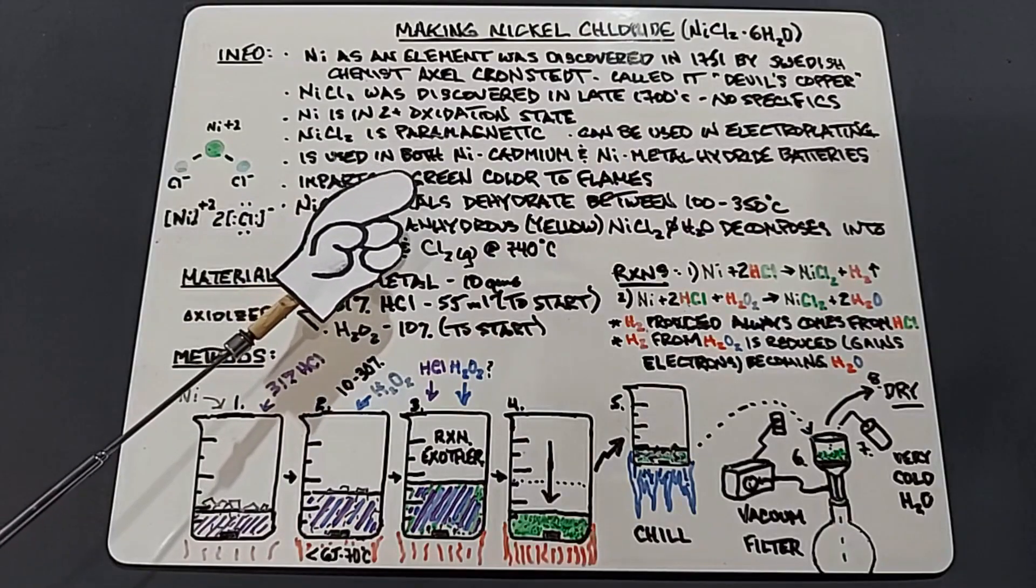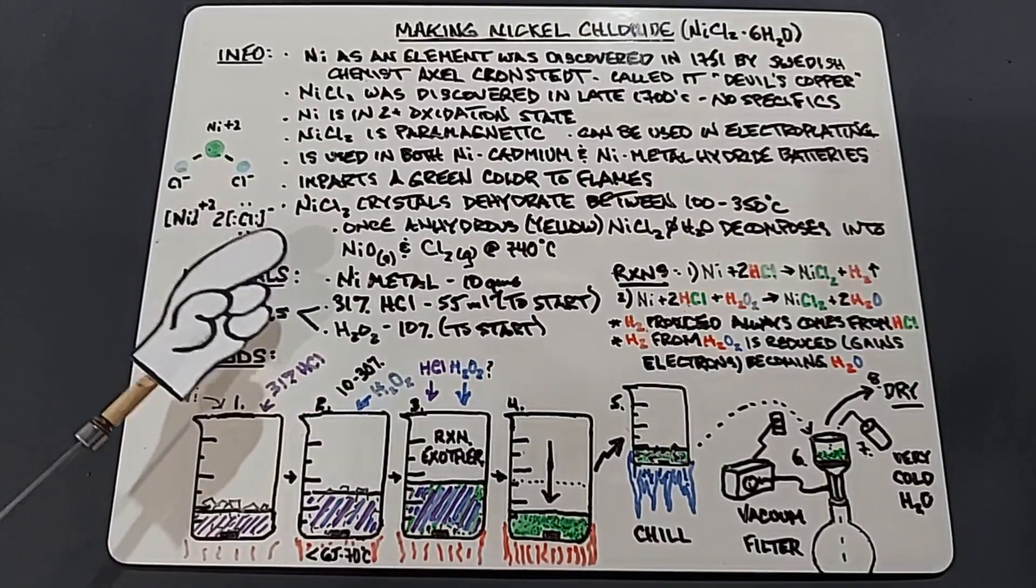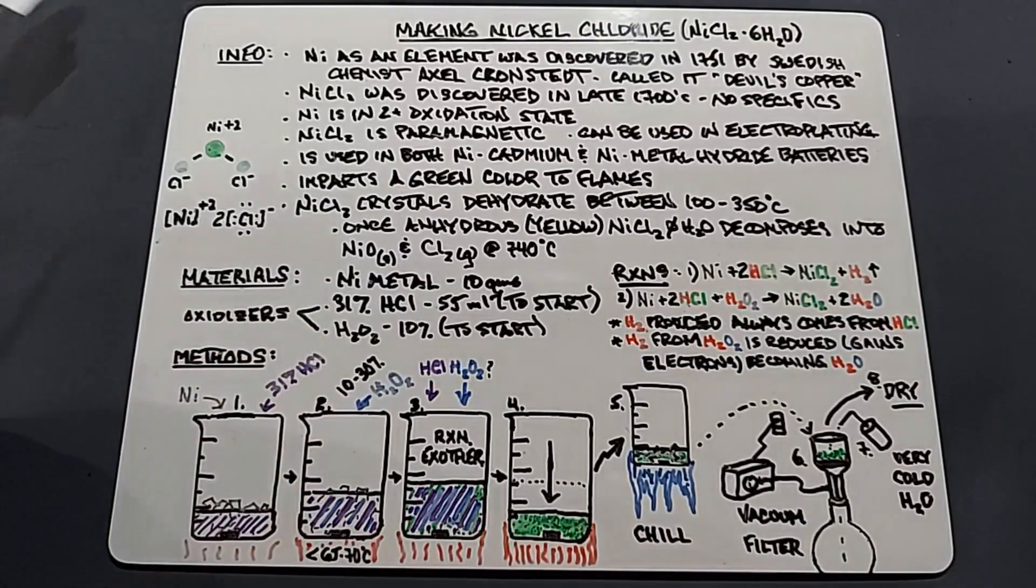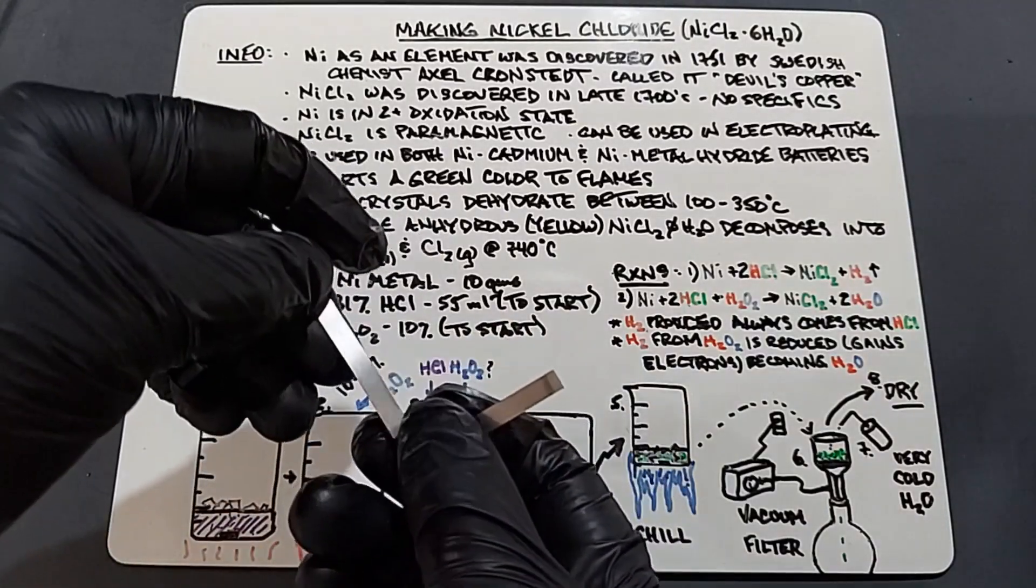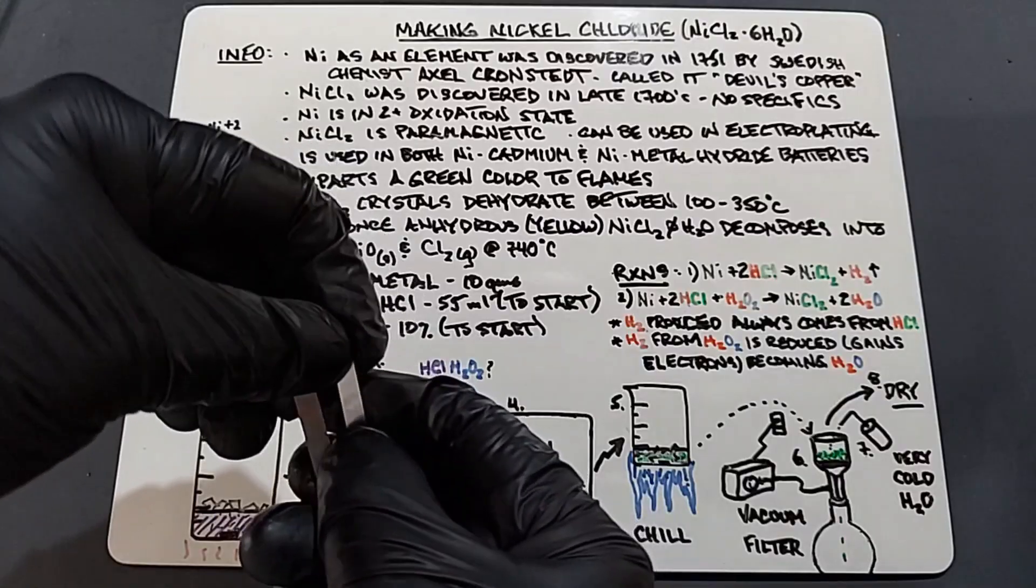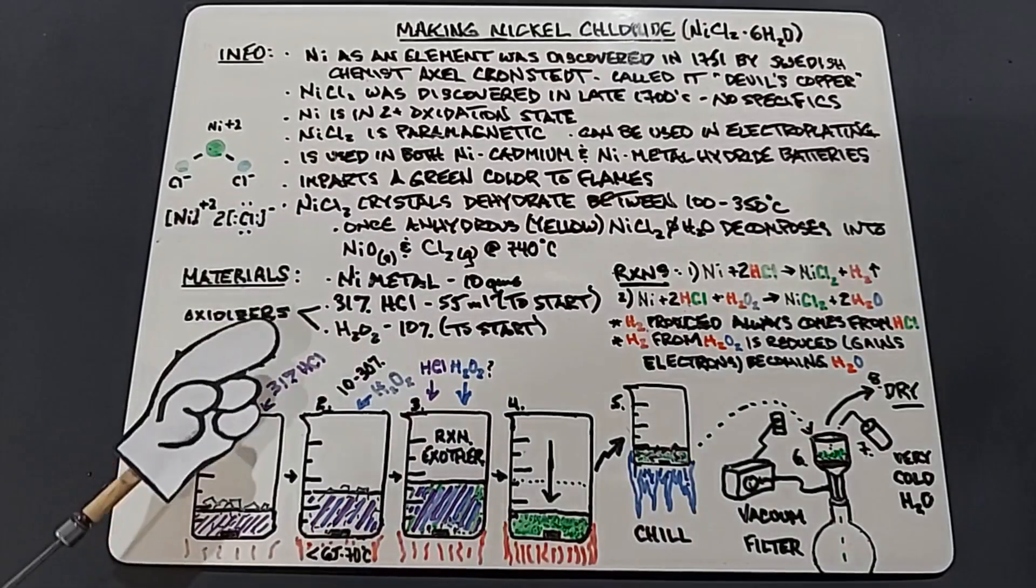Moving on to our materials, we need nickel metal—10 grams. I'm going to show you the kind of nickel I'm going to use. This time before, I tried to cut up rods and it was painfully slow to break up, but this time I have these nickel strips. So I'll weigh out 10 grams of these. And it turns out that, of course, pure nickel is magnetic.